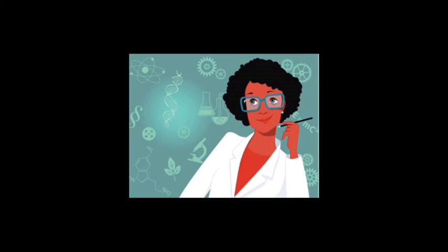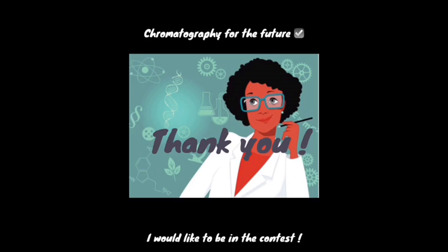Despite being in a pandemic and not being able to experience this lab in an actual laboratory, chromatography at home was fun and informative. It truly opened my mind that as humans, we use and rely on chromatography every day, and we can continue using it for future research and resources.